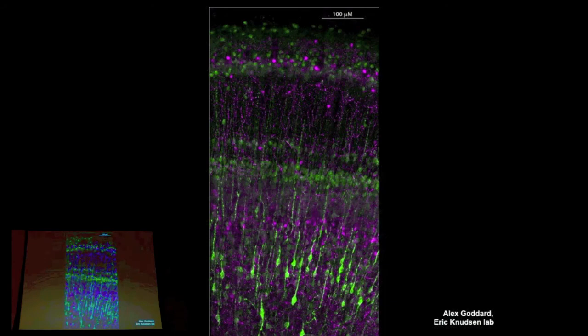Oh, sorry, did you say that was a Z-stack going from top to bottom there? He took a Z-stack through the optic tectum and tiled it, so he's getting multiple planes. The Z-stack is taken through the plane of the board, like this, and then it was 15 images, I think, 3 by 5, across the entire thing. And then they're projected down. A maximum intensity projection is collapsing that Z-stack down into a single plane. Some of the software that Forrest is going to talk about will do the harder work of stitching it all together, so it makes one nice big image.